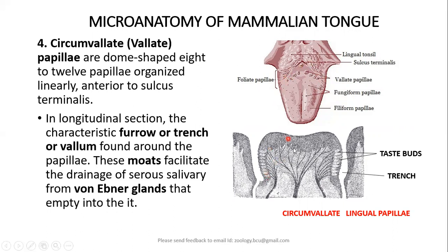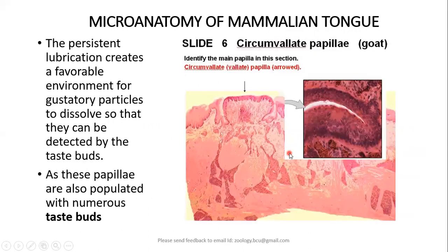And in the longitudinal section, we will be able to see very clearly a furrow or trench around the papilla.